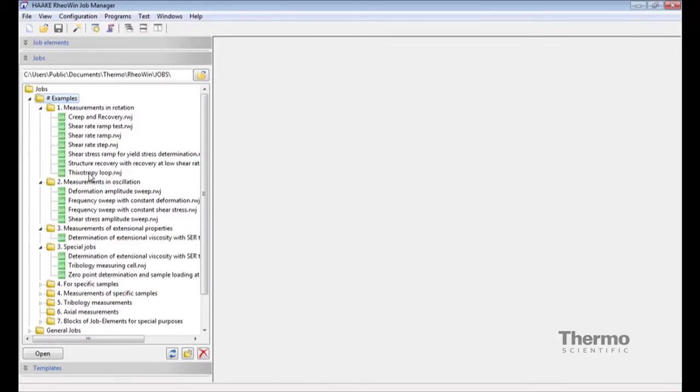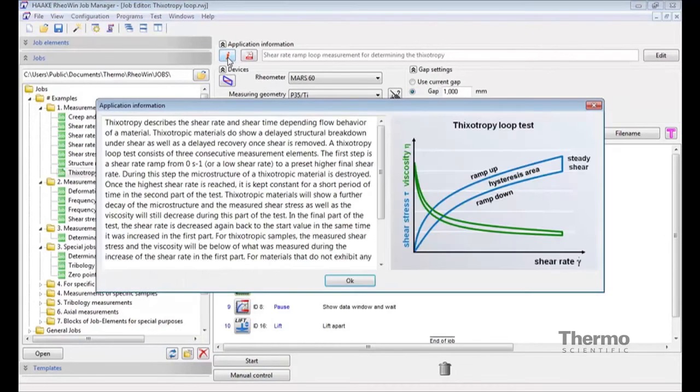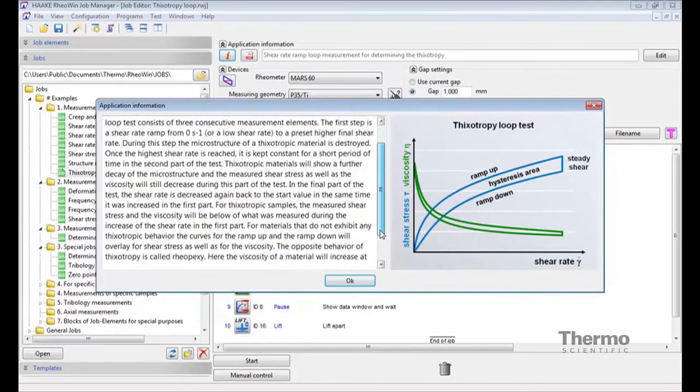Looking into a procedure like the classic thixotropy loop in more detail, you can see that precise application information is linked to the procedure itself, including a clear description in writing as well as graphically.